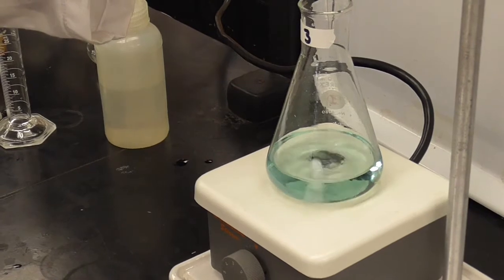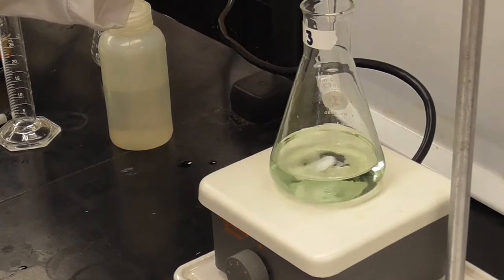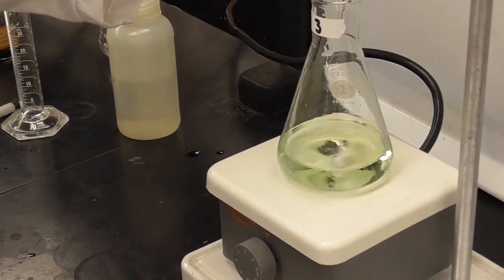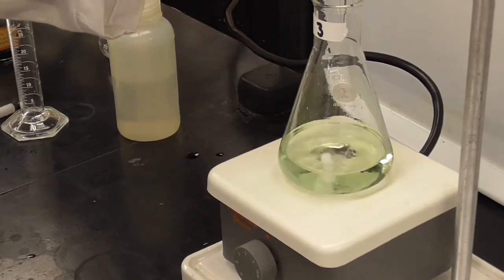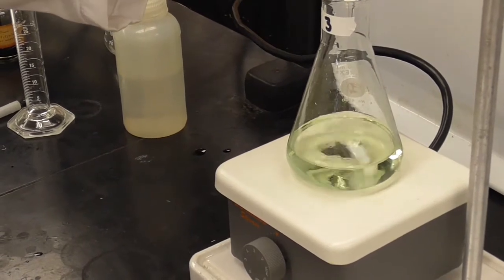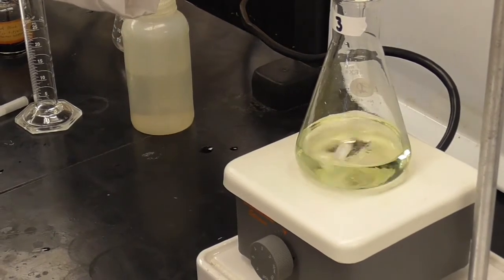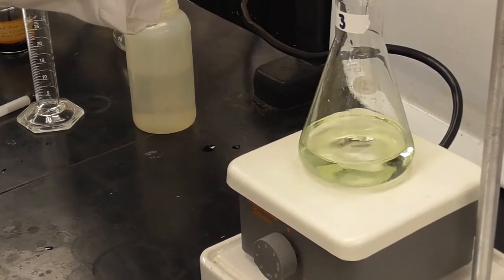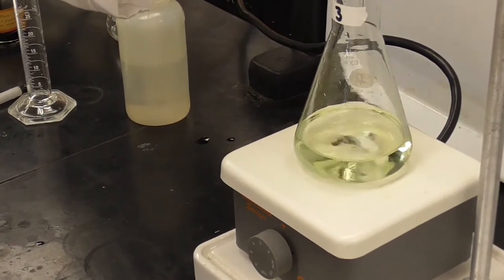It's kind of greenish now, so probably another couple of drops. There's yellow, but it's wanting to fade back to green, so another drop. That's going back to green again. Okay, let's see, that's still kind of greenish. Let's try one more drop. Okay, let's call that good.